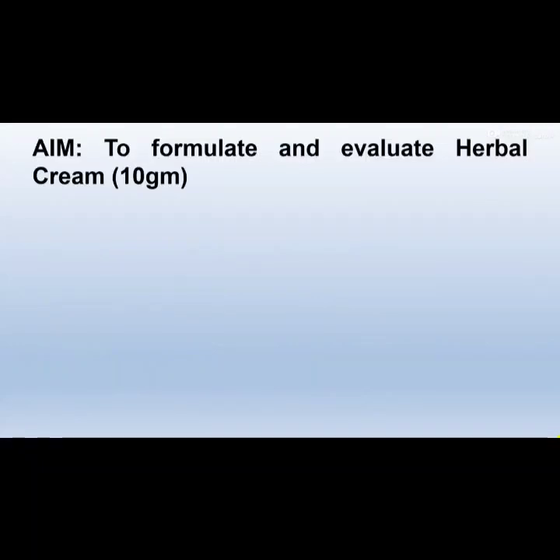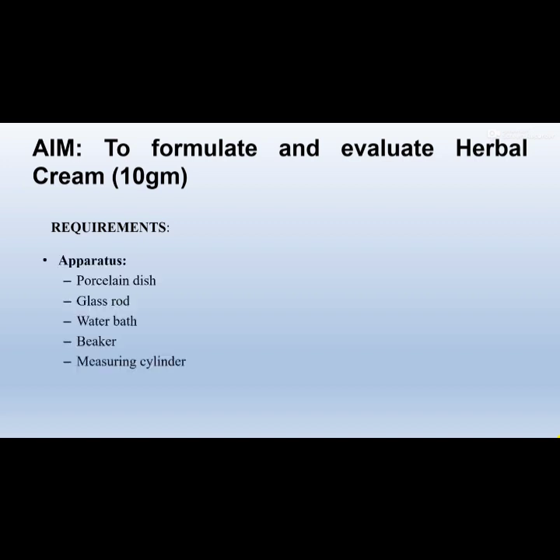We will study about the formulation and evaluation of herbal cream. So the requirements for the practical are: apparatus required are porcelain dish, glass rod, water bath, beaker and measuring cylinder. Chemicals required are white beeswax, mineral oil, rose water and borax.